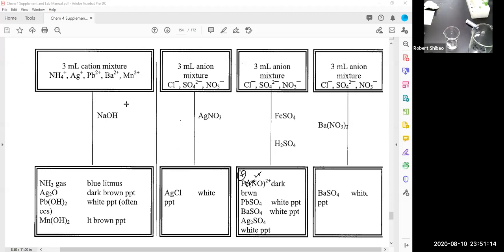Then what I'm going to do is add sodium hydroxide. Here, 6 molar, 1 molar, doesn't make much difference. I can use less of the 6 molar. I have to worry that if it gets too concentrated, there's potential for violent reaction. Violent is not redox. This is just acid-base, so a violent acid-base reaction just generates a lot of heat and steam.